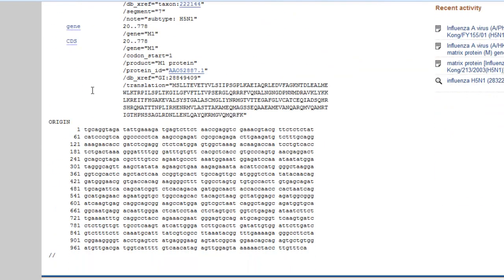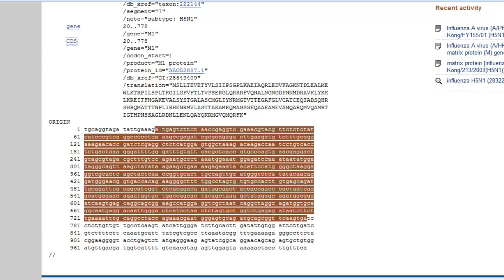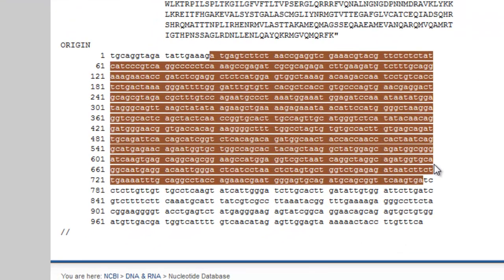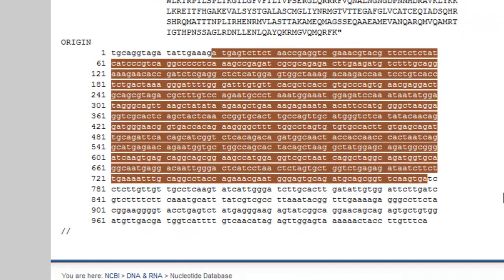So we're going to go ahead and click on the CDS. I'm just going to show you right here. This is the coding sequence for M1. M2 is not shown in this case specifically, because it's made by alternative splicing, and I'm not going to get into that right now.